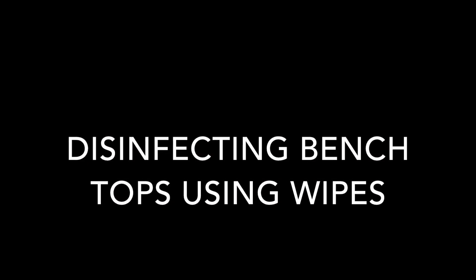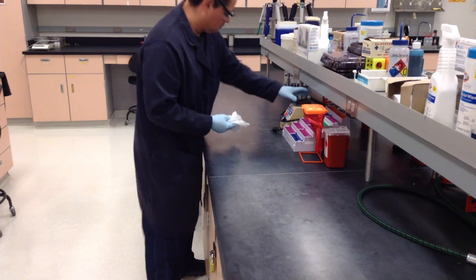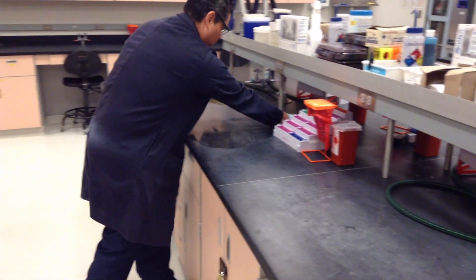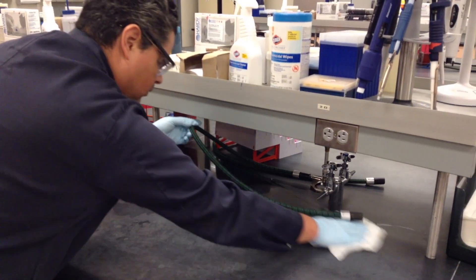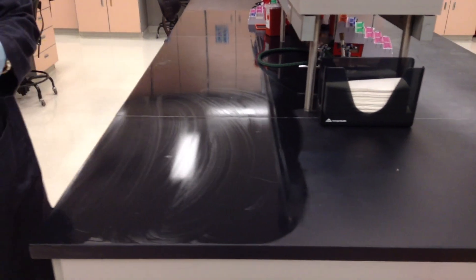One of the first things you'll do when coming to lab is disinfect the bench top. You'll find wipes on the top shelf of the bench. Pull out a wipe or two and begin to wipe down your half of the bench. Start at one end and remove any equipment that may be in your way, thoroughly wiping down the bench including the area underneath the top shelf. Make sure to wipe down the end of the bench too. Once done, dispose of the wipes in the regular trash bin and dispose your gloves in the red biohazard container.